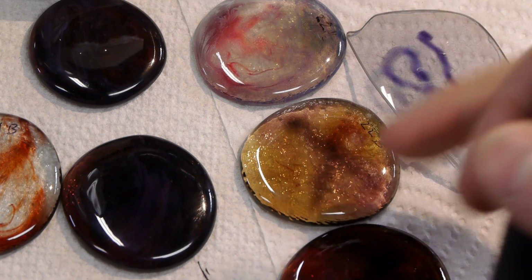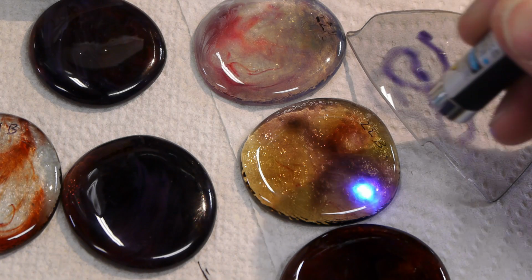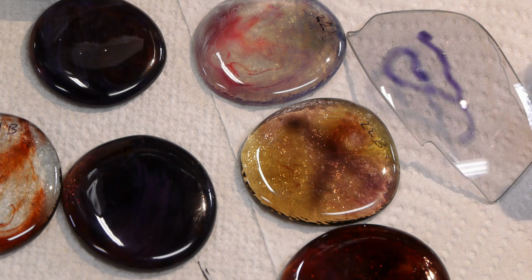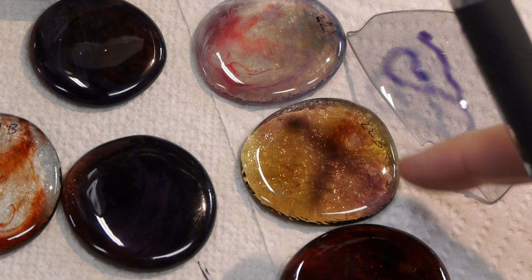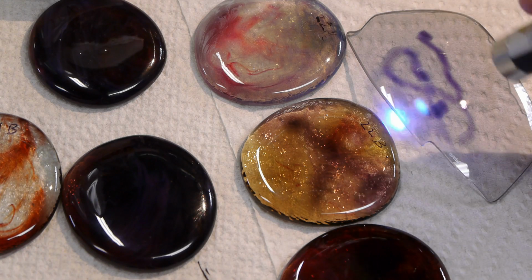Now all of these are actually reversible, so if we wait around long enough, both the commercial lens and the glasses that I've created will eventually go all the way back to their original state. In the commercial lens this happens in hopefully 5 to 10 minutes. In the glasses that I've created, it's quite a bit longer. I could time-lapse this, but it's really kind of an overnight thing for this to go back to its original clarity. Pretty cool though.